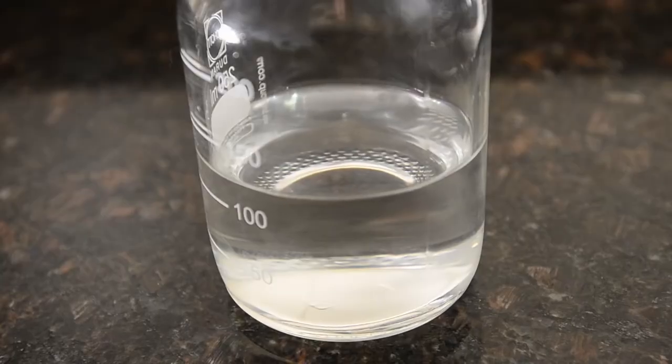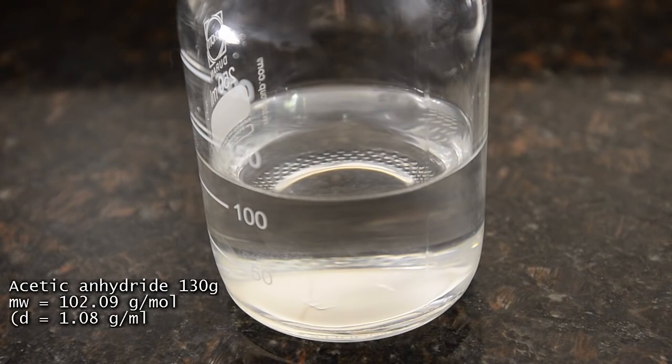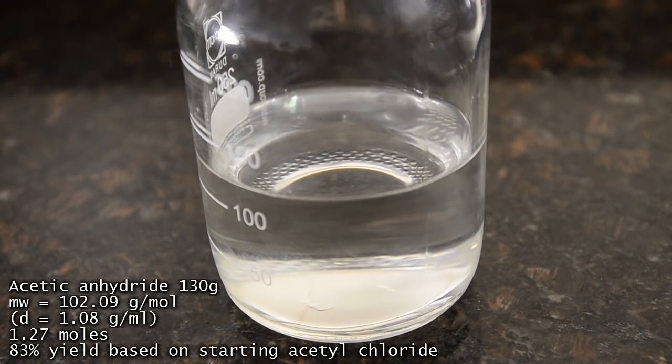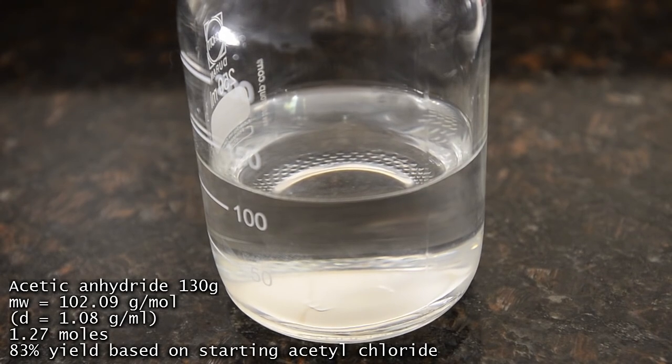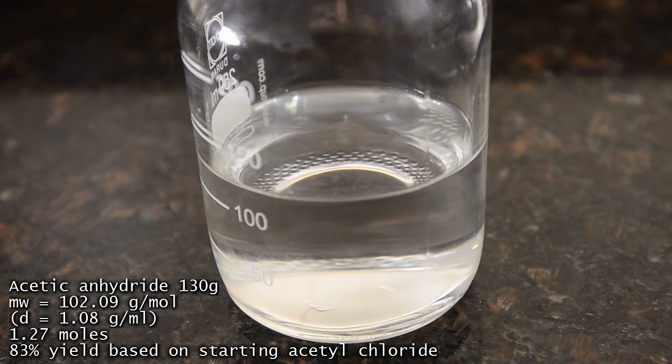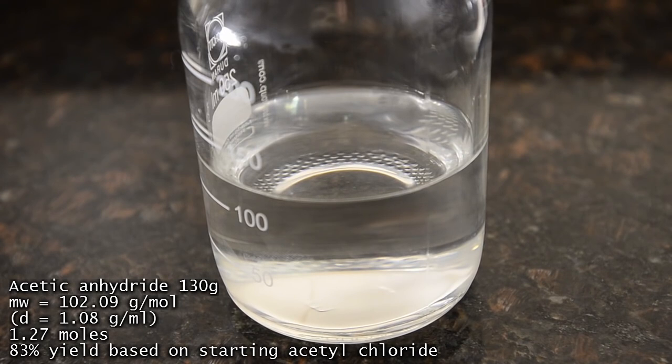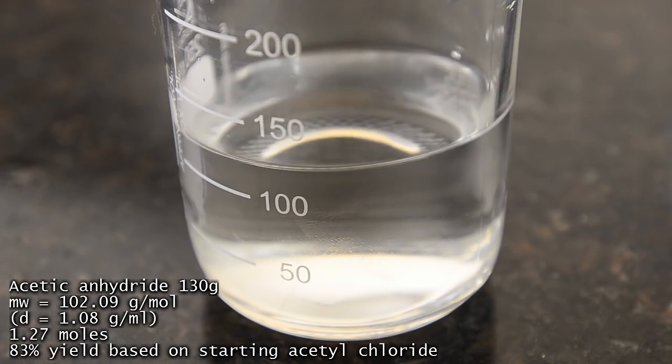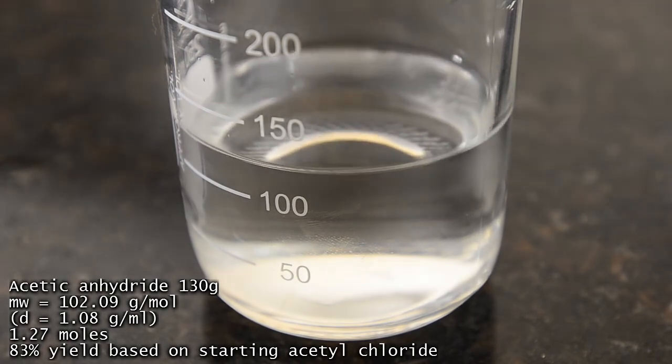Here's our final product, 130 grams of pure colorless acetic anhydride. Given that we used doubled the first reaction, this corresponds to an average yield on our first reaction of 83% based on acetyl chloride used. The product doesn't smell strongly of acetic acid.